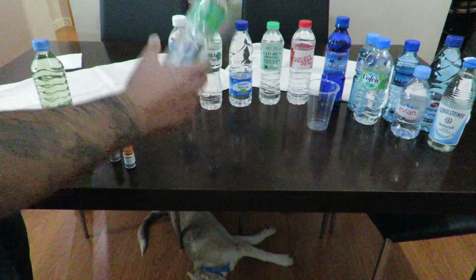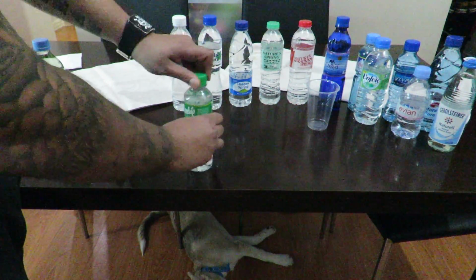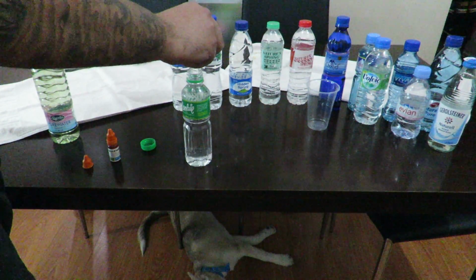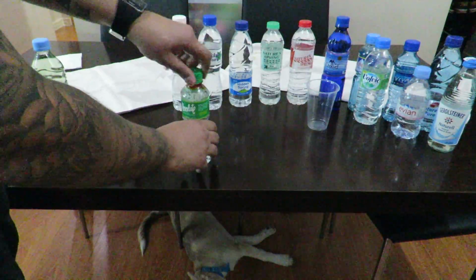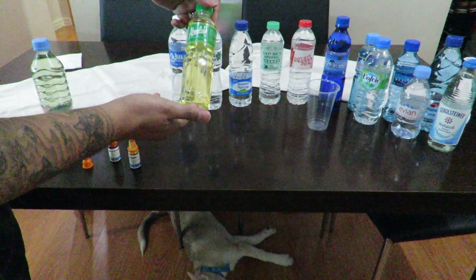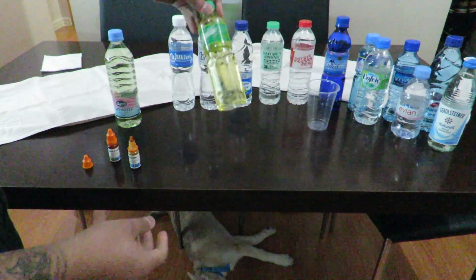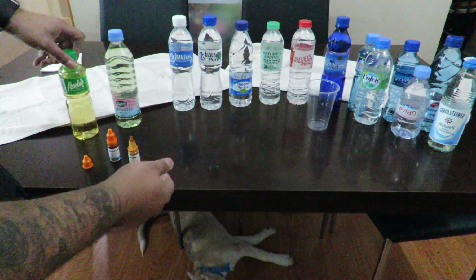Next is Absolute, and this one here is distilled, pure distilled drinking water. So we will go and add drops just to see what kind of drinking water we are drinking. Give it a shake. Whoa, never done that experiment before. So that one's not very good. I wouldn't want to drink this. It's up to you if you want to drink it or not.